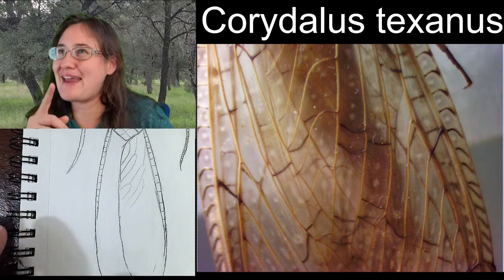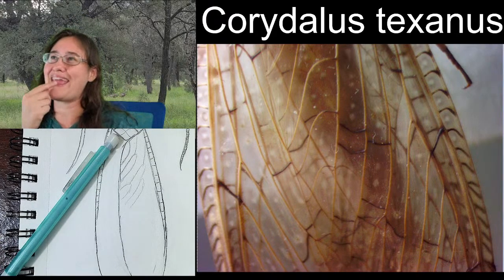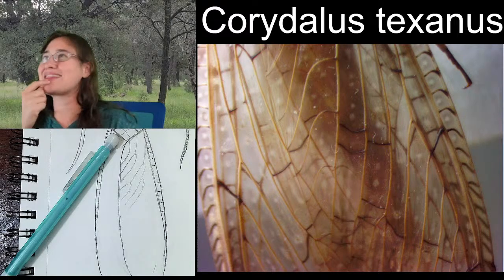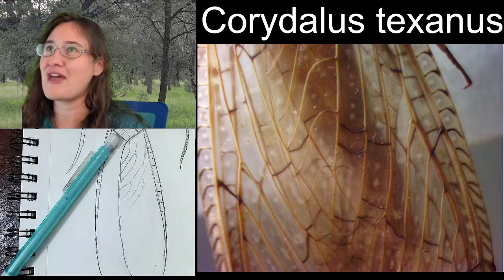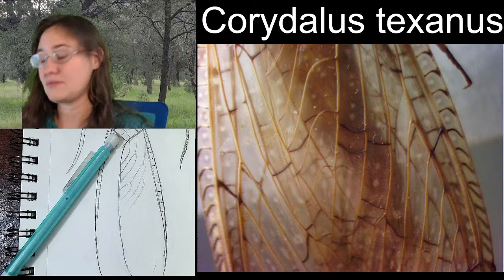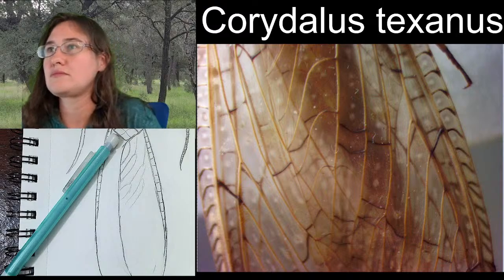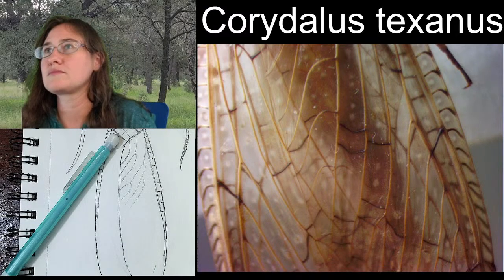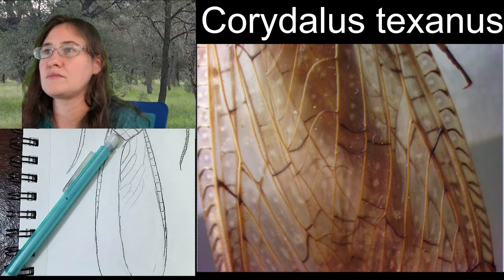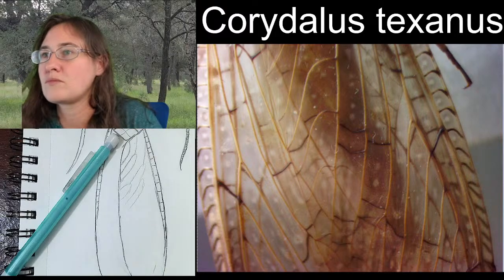Now, pinnate, I feel like I've heard the word pinnate used in entomology, but I think it was completely different than the way plant people use it. Nope.